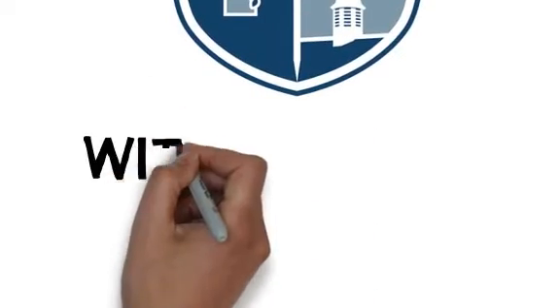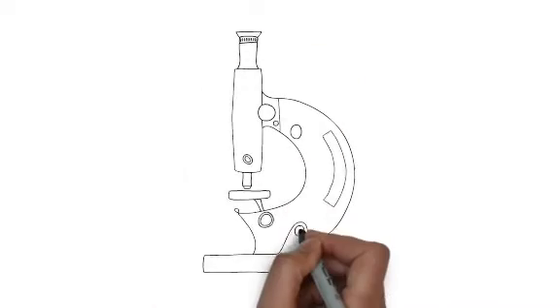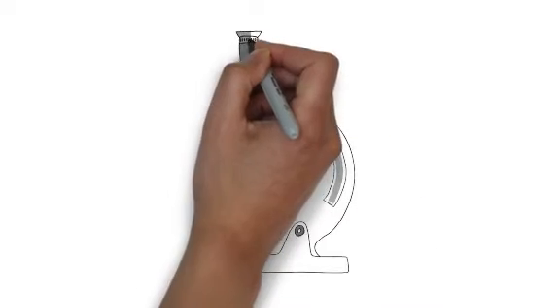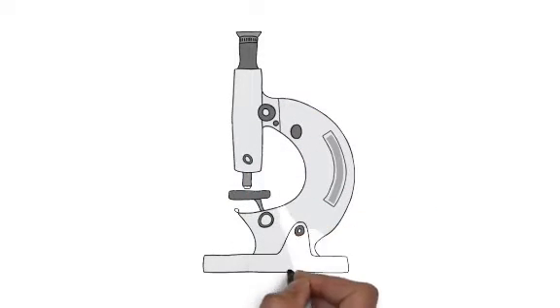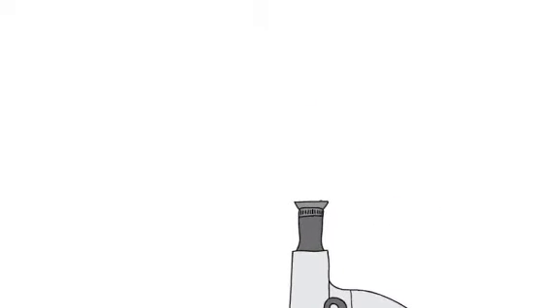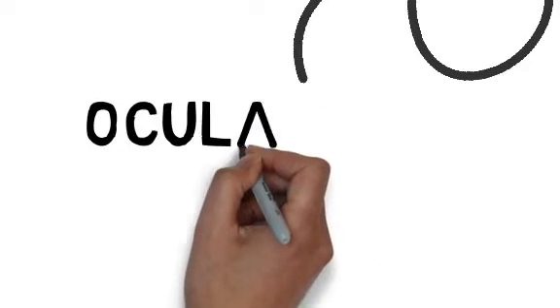Today we're going to start our unit on cells, but before we get into the nitty-gritty of it, we need to learn a few things about microscopes. Unfortunately, we can't learn from the ones at school right now, but let's take a look at one anyway. The first part we look at is the ocular lens, or the eyepiece. This lens magnifies objects by 10 times.